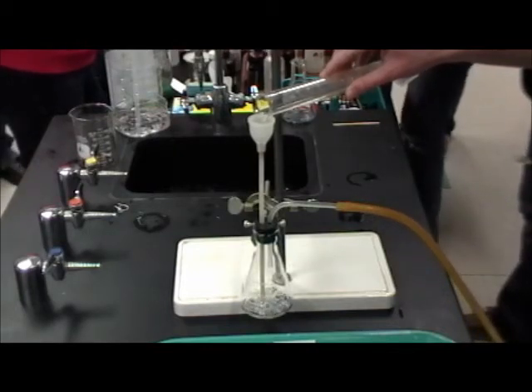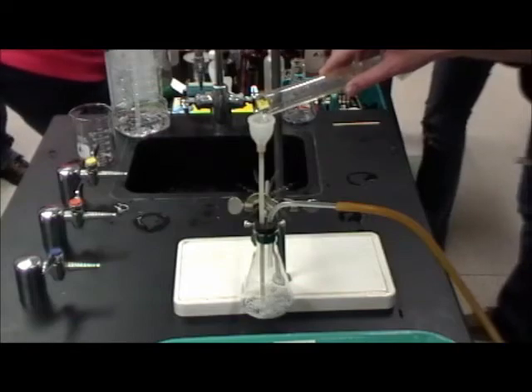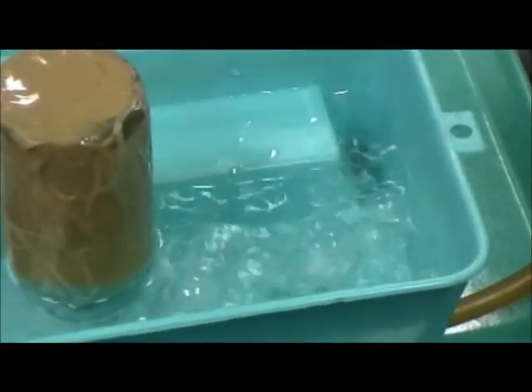When the hydrochloric acid reacts with the zinc, one of the products formed is going to be hydrogen gas. When you see the tank start to bubble, let those initial 10 seconds of bubbles pass through uncollected, because a lot of this is probably going to be air, oxygen and nitrogen gas, which you don't want. So after about 10 or 15 seconds, move the jar over, start collecting the hydrogen and let the jar fill up.